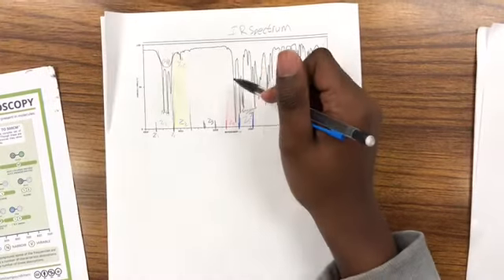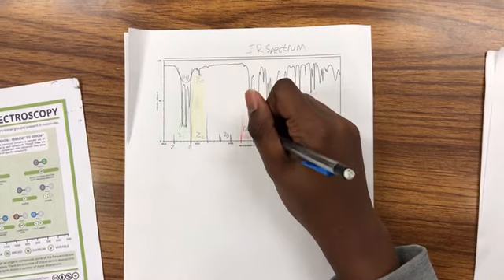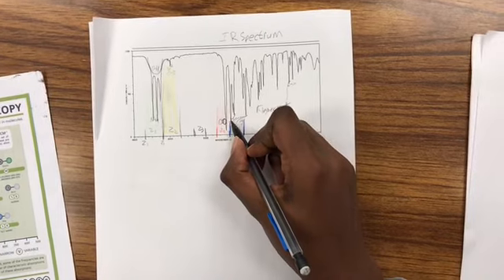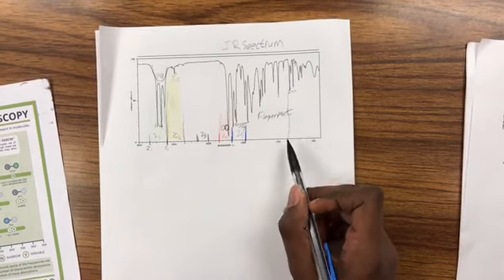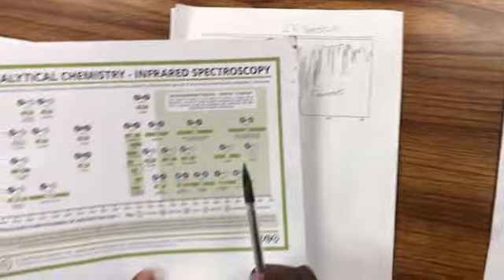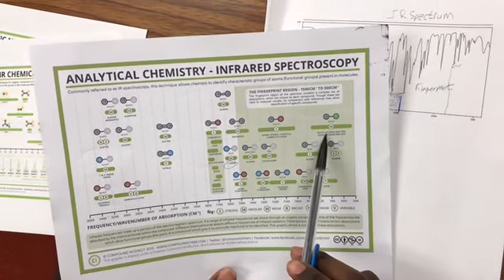With zone 4, I see a large distinct peak, which is a clear sign of a C double bond to an O. And for zone 5, I see 2 distinct things over here, which is a sign of a benzene ring. If we move on to the fingerprint region, there's a possible sign of a C bound to a halogen, like some kind of alkyl chloride.